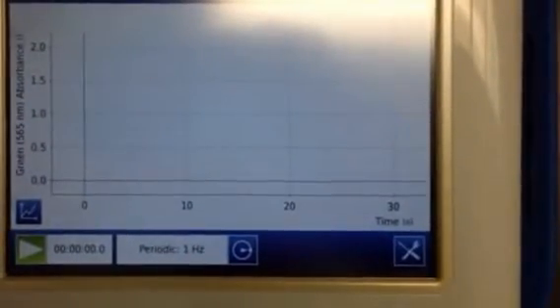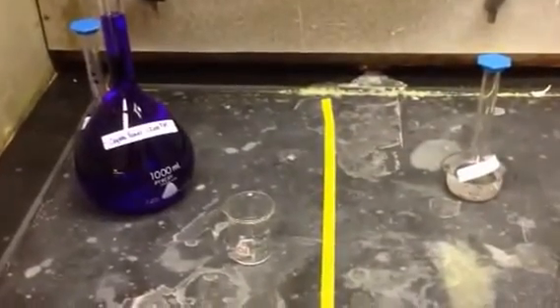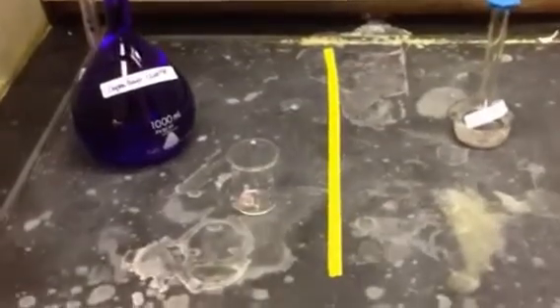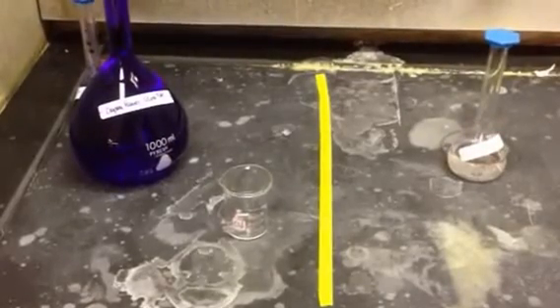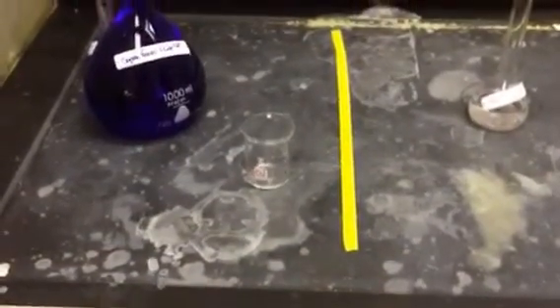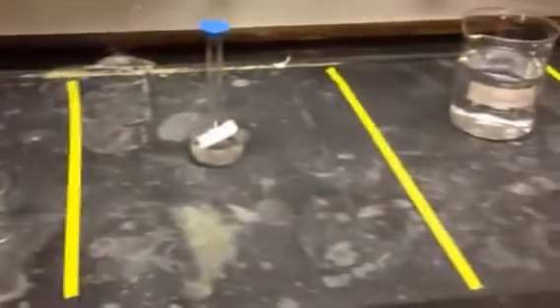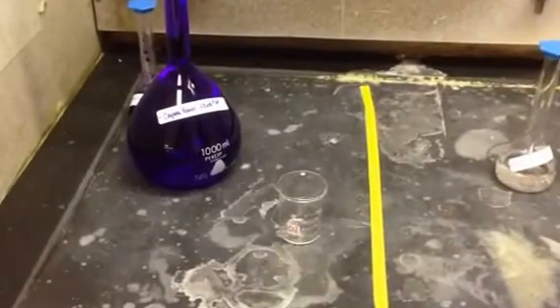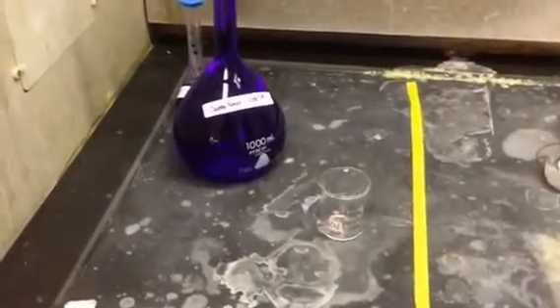Now that the graph is set up, you can start putting in chemicals. We keep our chemicals in the hood, even though we're not using truly caustic levels of sodium hydroxide or crystal violet. We want to observe proper safety procedures, and of course you'll be wearing your goggles. Use your 50 or 100 milliliter beaker. The directions say to add about 20 milliliters of crystal violet, sodium hydroxide, and water — you can use a pipette or just pour a little bit in. We have quite a bit more crystal violet than we need, so I'm not worried about having exactly 20 milliliters in your small beaker.